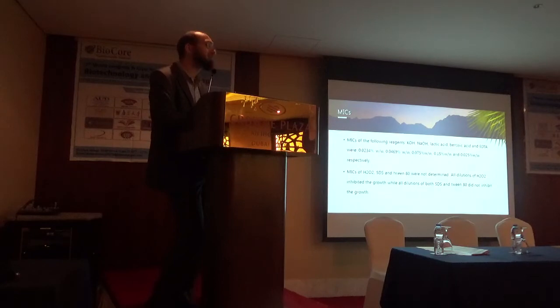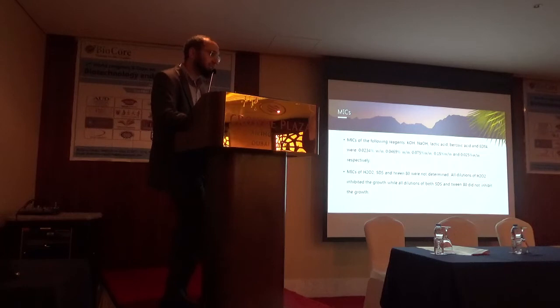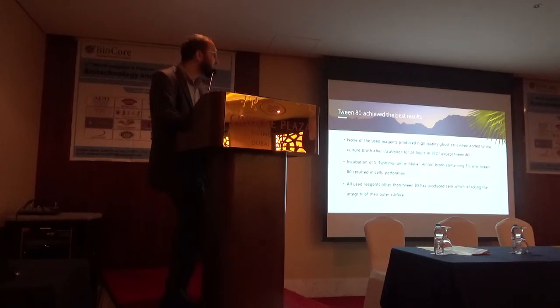The MICs of different agents like potassium hydroxide, sodium hydroxide, and others are given in these values. For hydrogen peroxide, SDS, and Tween 80, the MIC was not determined, because all dilutions of H2O2, or hydrogen peroxide, inhibit all growth. So MIC was not determined. The others, like Tween 80 and SDS, didn't inhibit any growth actually, so there is no MIC.